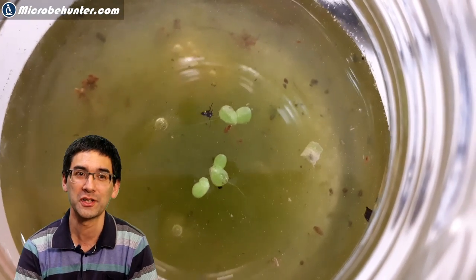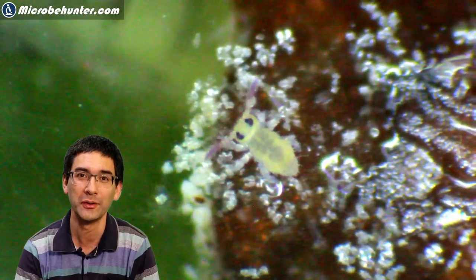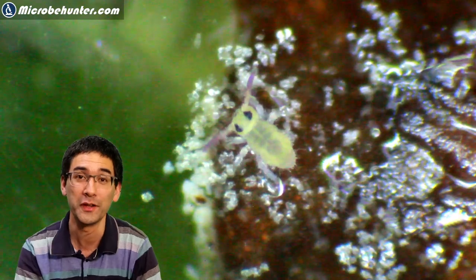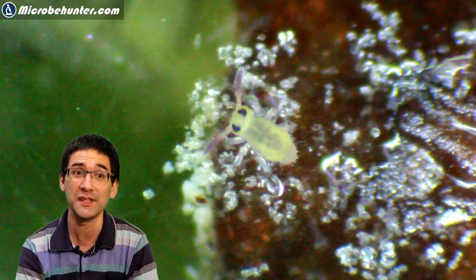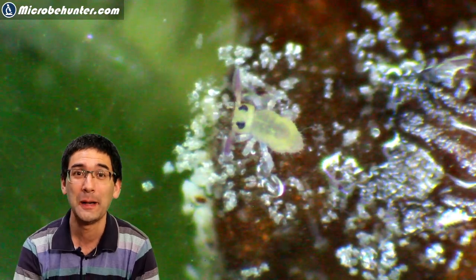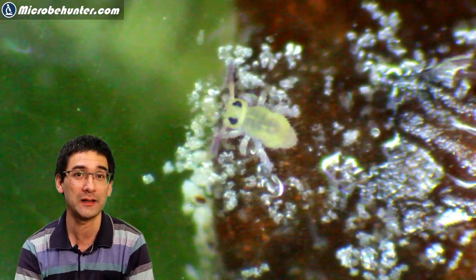At home, this is what I saw. There were also some other water plants growing, and I put them under my stereo microscope. There was a whole bunch of other insects as well. I have no idea what this one is—it looks kind of cute, but I have no idea what it is.